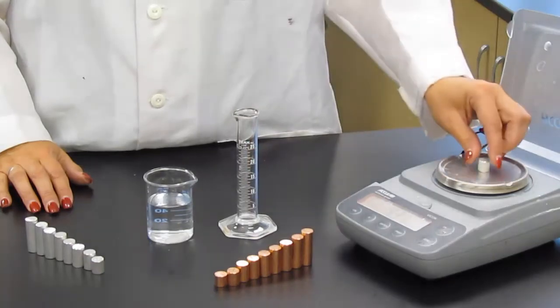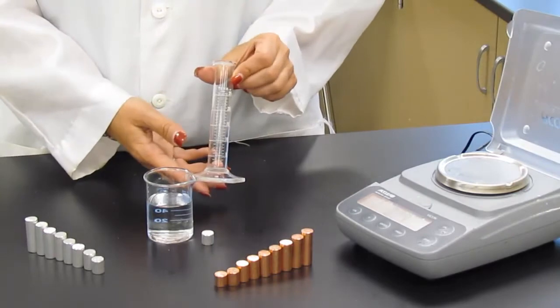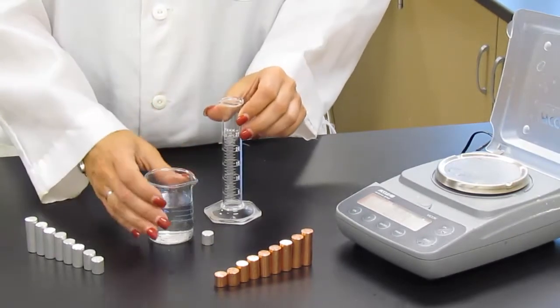Then you're going to need to find the volume. To do this, we're going to use water displacement. You'll need a graduated cylinder, a 25 milliliter would be ideal.